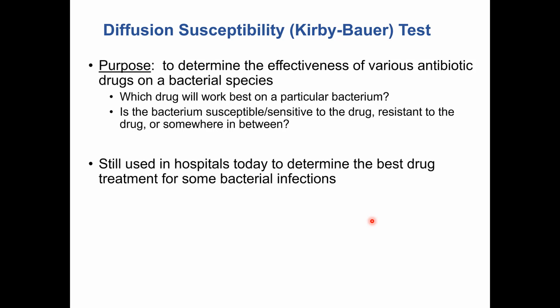And the reason for wanting to know this is really in the hospital setting. This test is still being done today on patients who have bacterial infections that might not be responding to typical antibiotic treatment. And so you might need to find out, is there a better drug for this infection that I could be using instead? So you do this Kirby-Bauer test and figure out which antibiotic works the best against that particular infection.